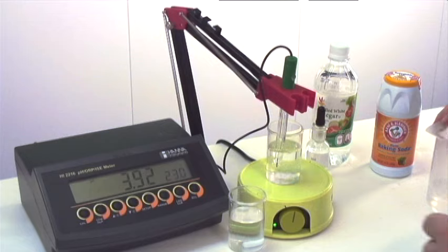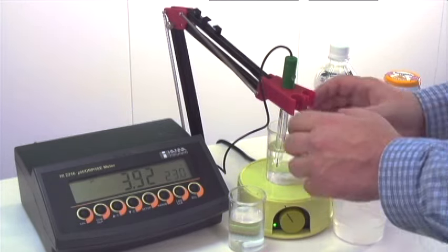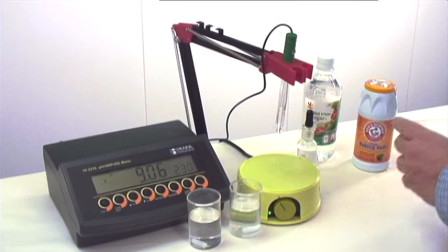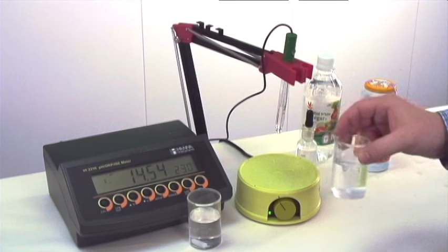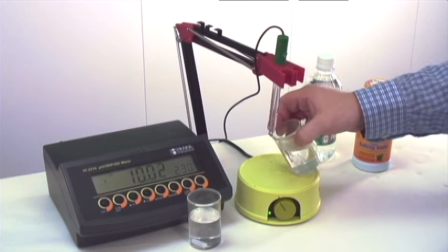Now I'm going to rinse off the electrode, and we're going to take the pH of the deionized water with baking soda.